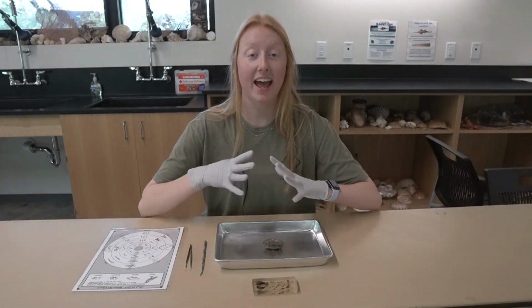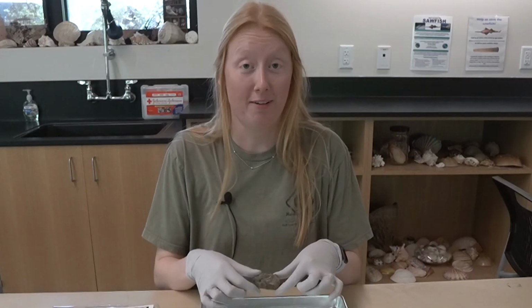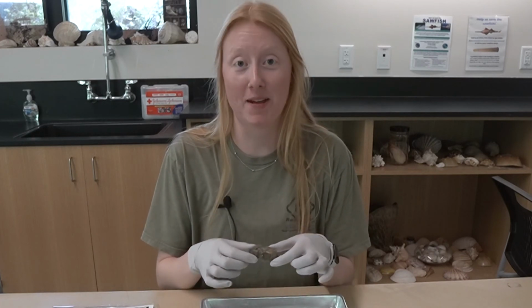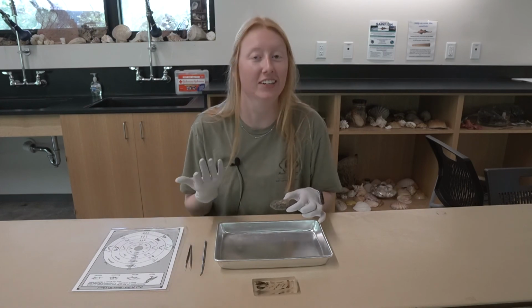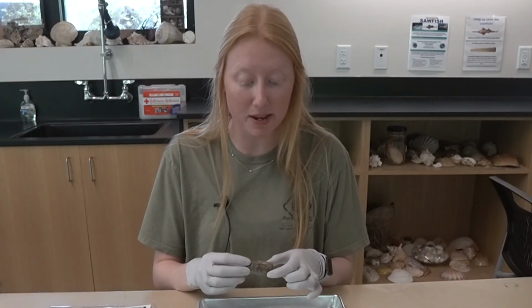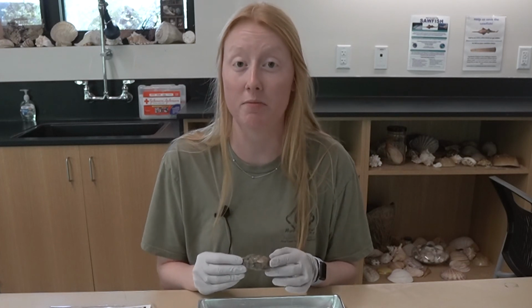So now moving on to the actual dissection part of this lesson. We have a real life owl pellet right here in my hand. It was wrapped up in some tin foil, so that's how they come, like I said, looking like little baked potatoes. And in this is going to be lots of fur, lots of bone. You can even see some bone right here on the surface before we've even broken into it.